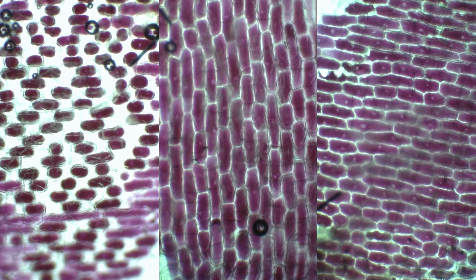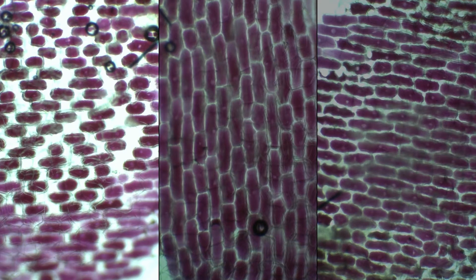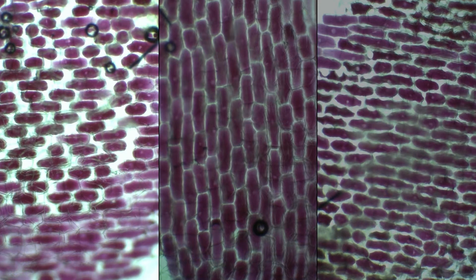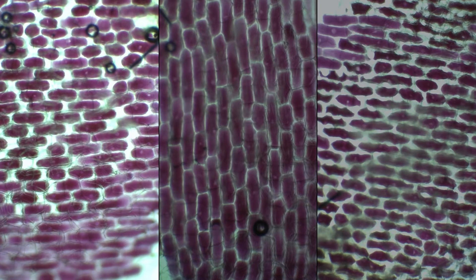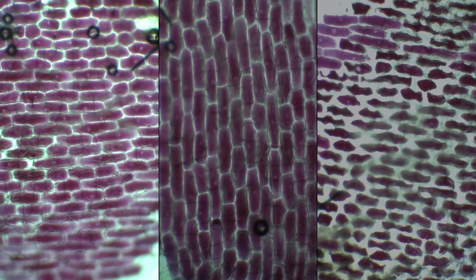You can see here the three conditions. On the left there we've got the ones that were in pure distilled water. We had a much higher water potential outside the cell than inside. What that means is that water has moved into the cells and those cells have swollen up. In plants we call this turgidity — those cells are described as turgid. They've got lots of water in them; the vacuole is full of water and it's pushing on the outside of the cell.